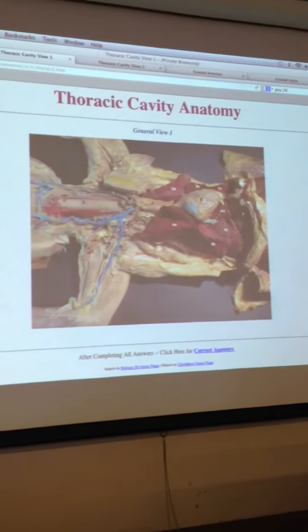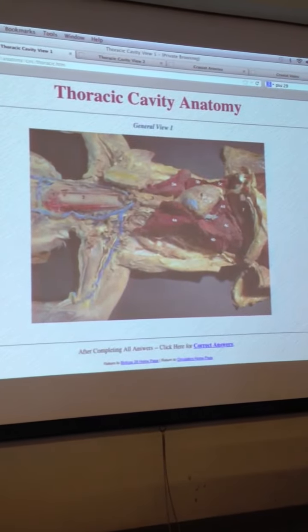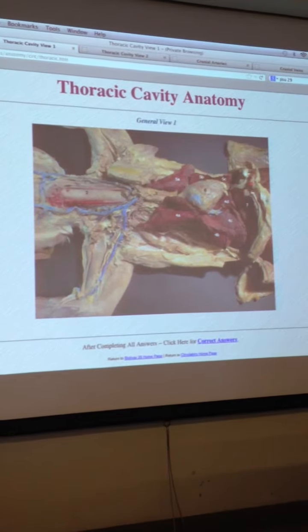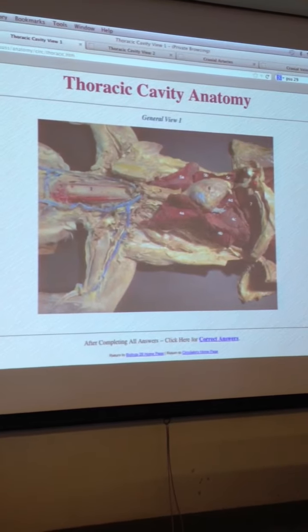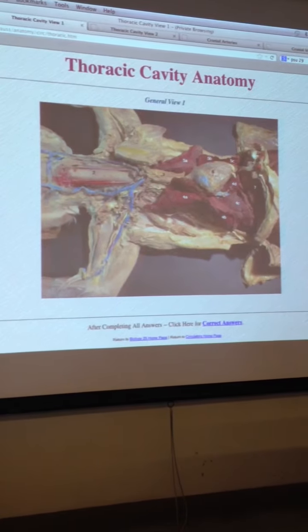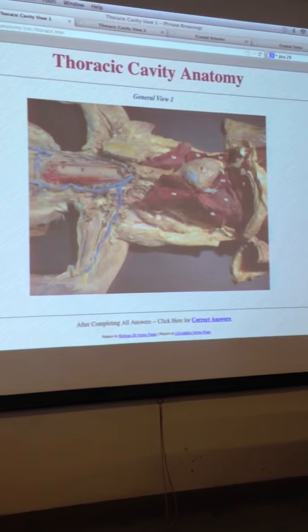Abdominal cavity, this is the diaphragm, all right? So the diaphragm is the official split line between the thoracic cavity and the abdominal cavity. When we do the dissection, we're not going to make this cut that you see here on either side. We're just going to do straight down the middle, and then using your hands we'll push the diaphragm down to detach it from the muscle wall.